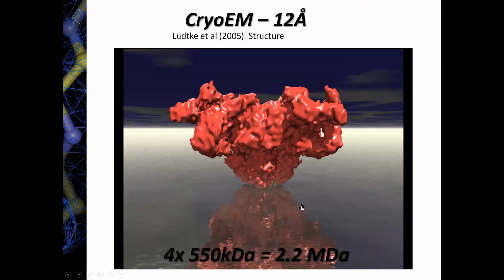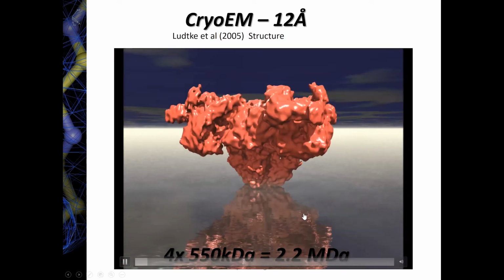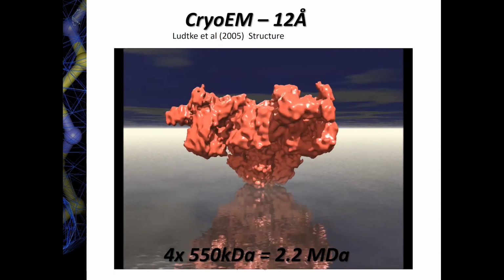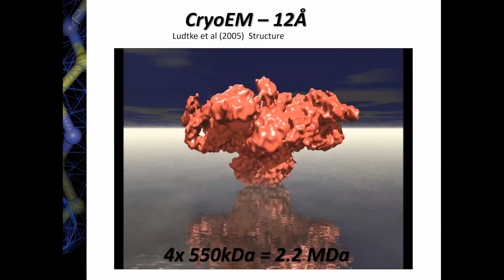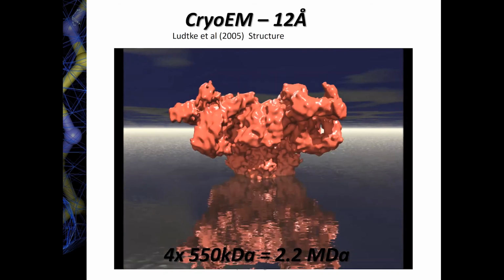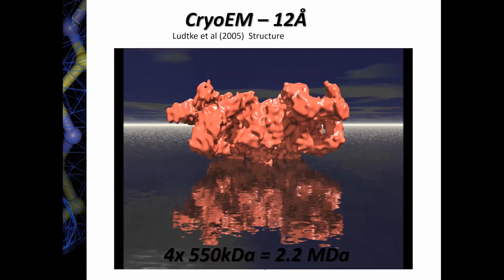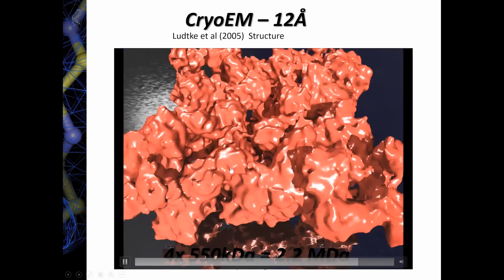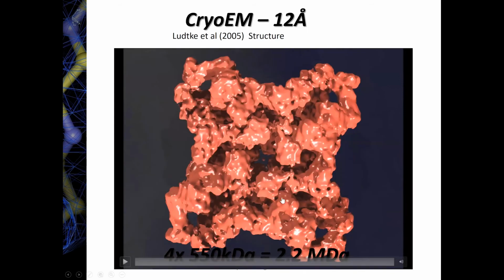So I'm primarily a structural biologist, so I like to look at structures. Now, the Ryanodine receptor is a huge protein, 2.2 megadalton in size, and that makes it a key target for cryo-EM studies. And in fact, many studies have been performed already in the past. Already since the 1980s, there was a negative stain EM imaging that was done. I'm showing here a study. This is a particular structure from Irina Serysheva's group, which just highlights the overall architecture.